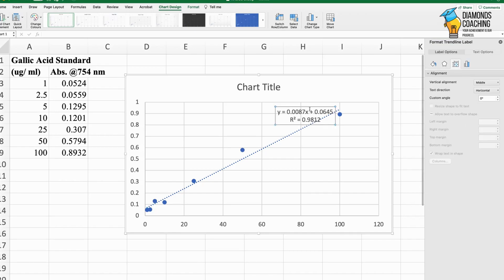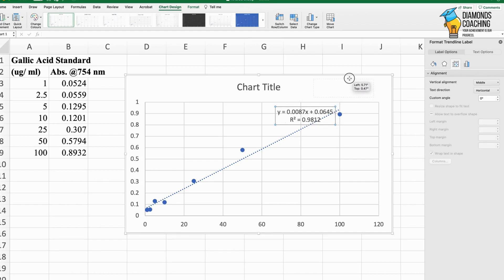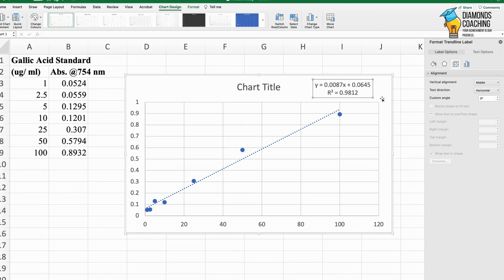The second-to-last option shows display equation on chart and display r-squared value on chart. The recommended r-squared value is 0.9 and above, which shows us that we are going on the right path.